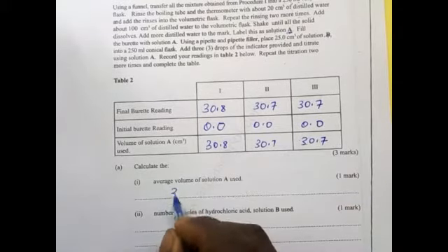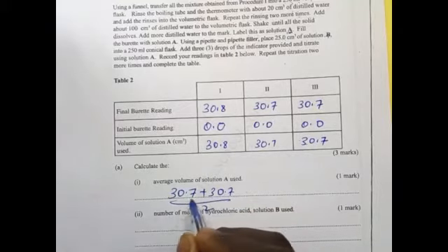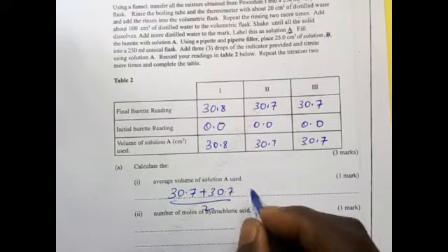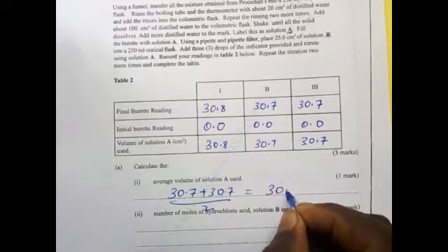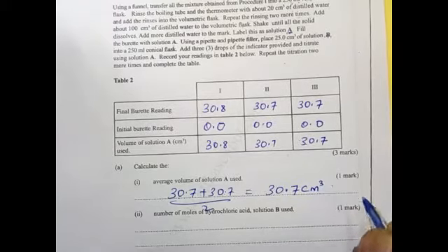So the average is 30.7 plus 30.7 divided by 2, because I have done it with only 2. If I did all of them, I would divide by 3. This will give me 30.7 centimeters cube. That's my average.